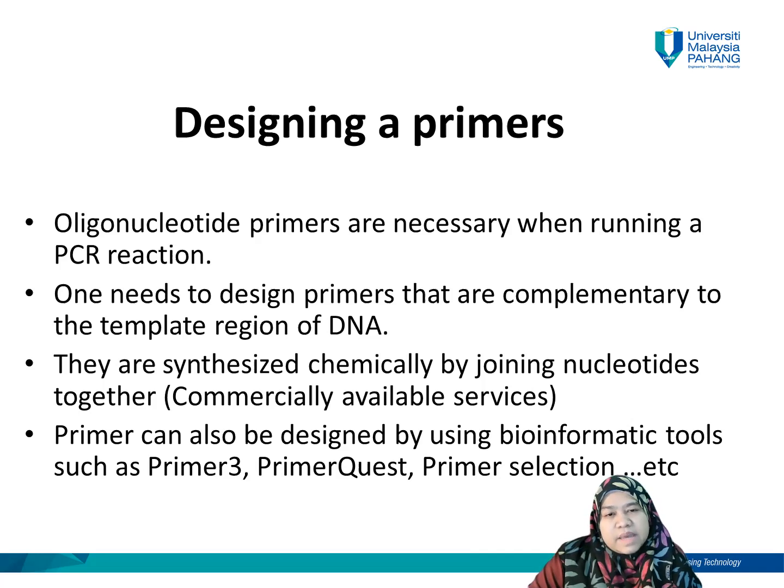They are synthesized chemically by joining nucleotides together. These services we can get outsourced from other companies. You need to design the primers and then send the sequence to the company, and the company will produce the primer, synthesized chemically, to give you as a primer.